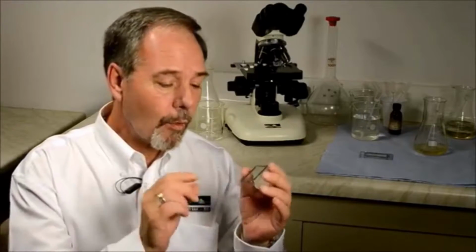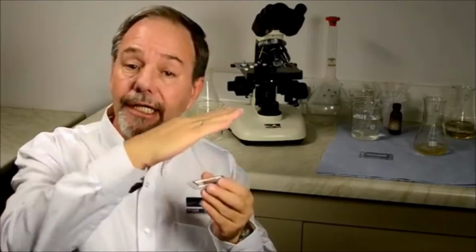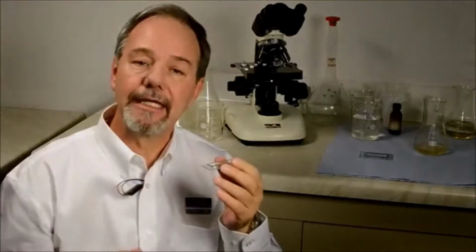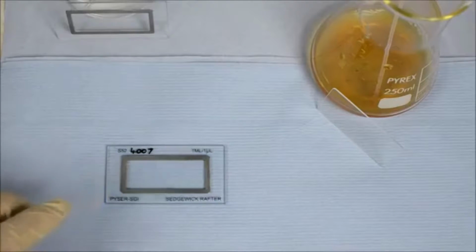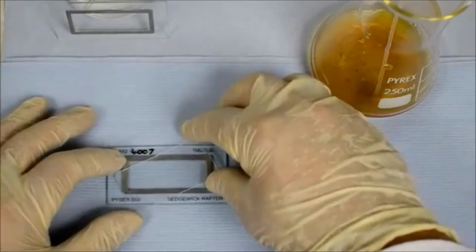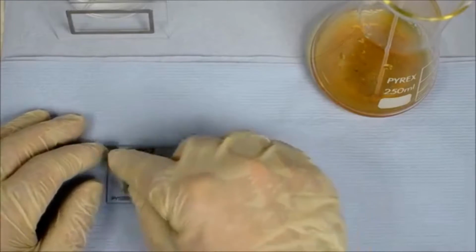Now, the Sedgewick Rafter chamber will enclose 1 milliliter of water trapped within the cell frame beneath the cover glass. It can be difficult to fill without trapping bubbles, but I'll show you a technique or method of filling. Now, the cell can be used with either living or preserved material. To fill the cell, first we must place our cover glass over the chamber on its border here at an angle. Now that's a gap at both sides, you'll notice.